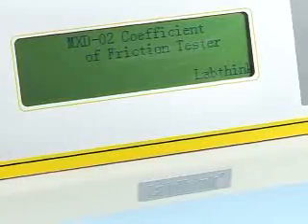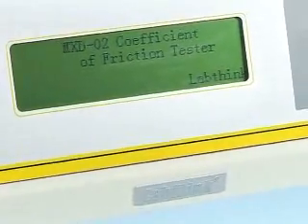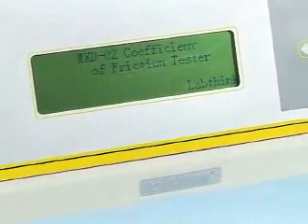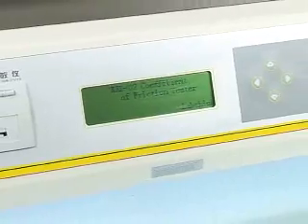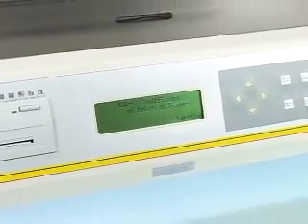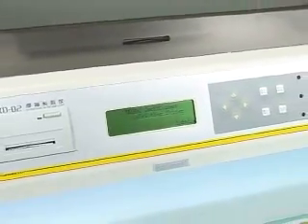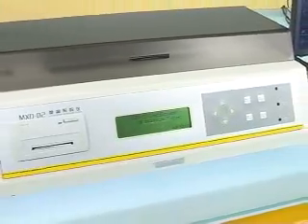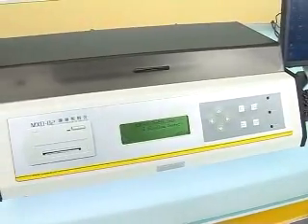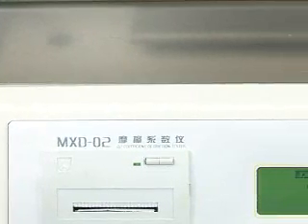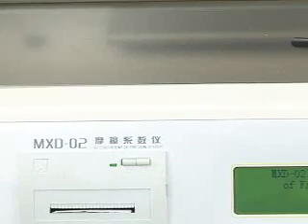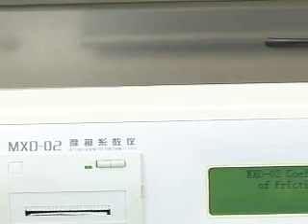The MxD02 Coefficient of Friction Tester is applicable in static and kinetic coefficient of friction tests for plastic films, foils, paper, and other materials. Users can control quality technique data by testing smoothness of the materials, such as usual pack fill property of packages, the speed of packing machines, and so on.